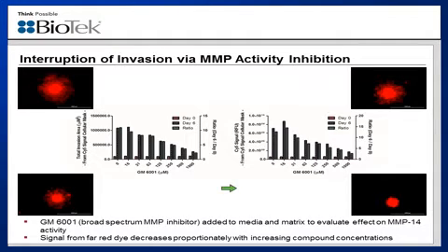And this can accurately be detected and measured through the incorporation of the Cytation 5 and the Gen5 data analysis software.